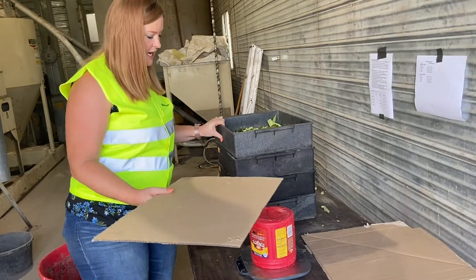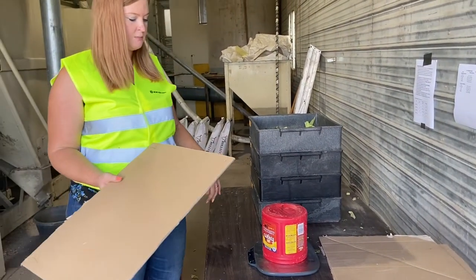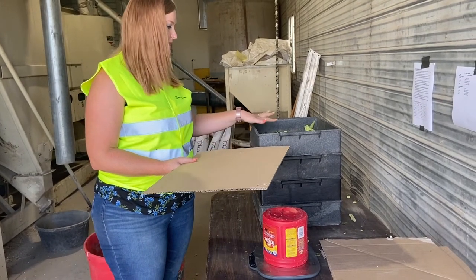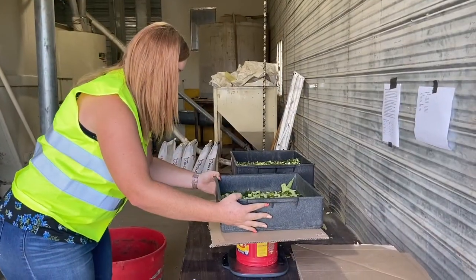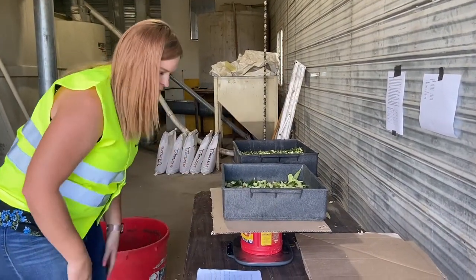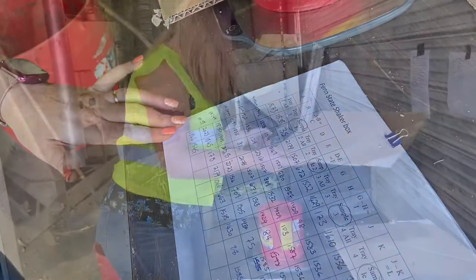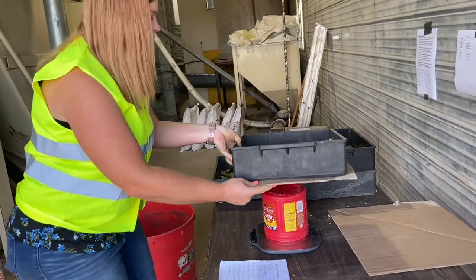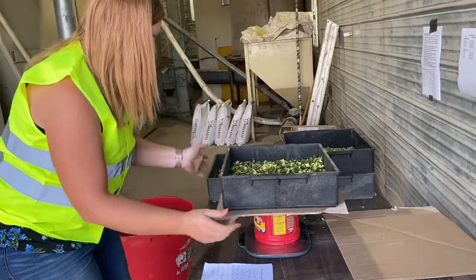We're going to weigh them together and then when we do our calculations, we're just going to subtract the cardboard and the tray from the sample so we actually know how much sample is on the tray. We use the cardboard just so that we don't lose any sample, because otherwise it's not very accurate.